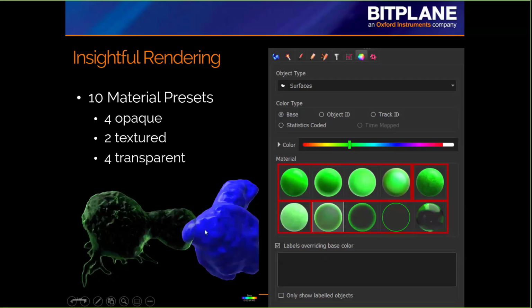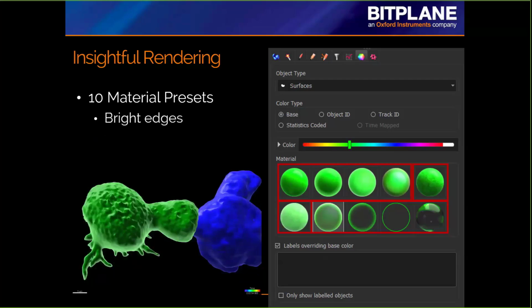And then I'm going to show you one more transparent type, and that's the one on the end. It's the glacier one, one of my favorites, because it does give you an even clearer look through, or a more transparent look through the surface. And so again, you have these options to play around with, and they do work in the vast majority of situations.